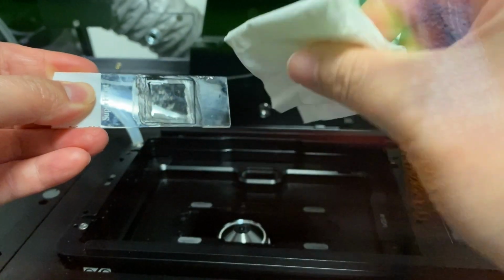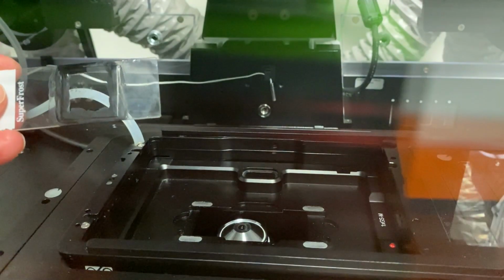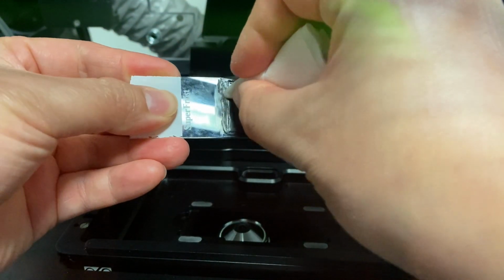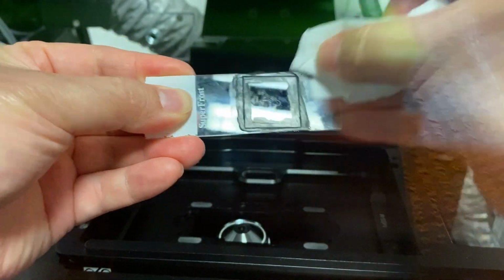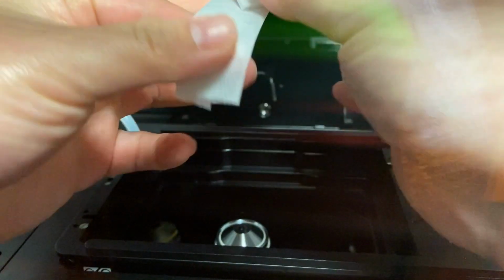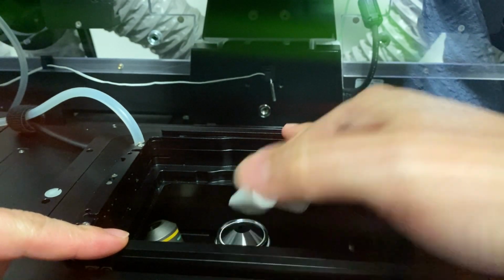So using dry Kleenex tissue, just wipe away as much excess oil as you can. Then use some ethanol and tissue to clean your sample if you want to use it again. And don't forget to dry your sample. To clean the lens, you first have to remove the sample holder. And then using dry lens tissue, you want to remove as much excess oil from the surface as you can.